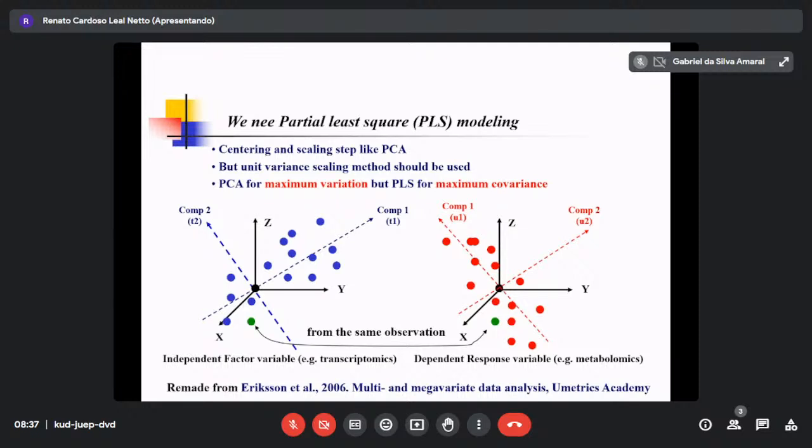The easy way is active and non-active. Non-active is 0. Active is 1. Then you can put 1. We call it a dummy, one classification. Otherwise, you can put multiple levels: active, non-active, or in between, middle active, slightly active. You can put 1, 2, 3 levels.